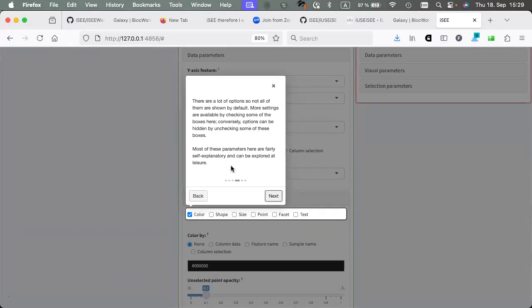So each of the built-in panels within iSEE comes with these kinds of tours. And you can imagine that this tour is a perfect way, for example, to take a legend of your figure in the manuscript and make it live. Because you can start, for example, by welcoming someone that comes to your app, and then you found something cool and you want to talk about it, and you put a spotlight on the individual aspects of that. And you're inviting them to feel free to change at any time the genes that you're displaying, because that's actually what you can do with this.